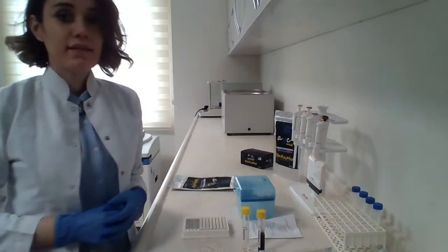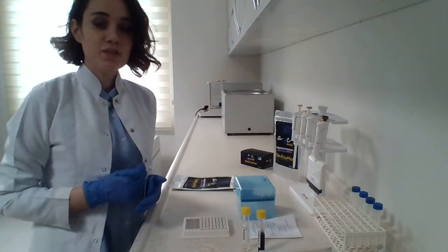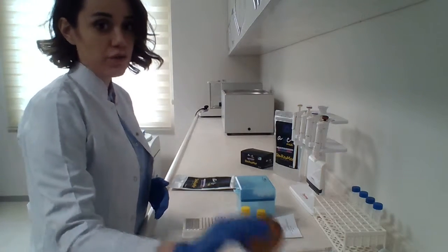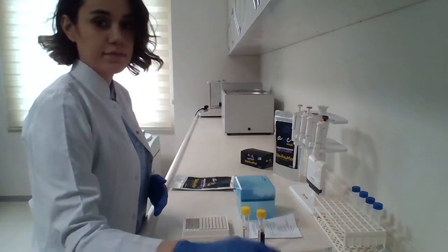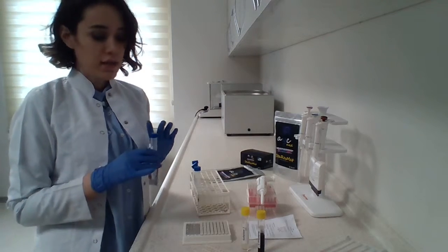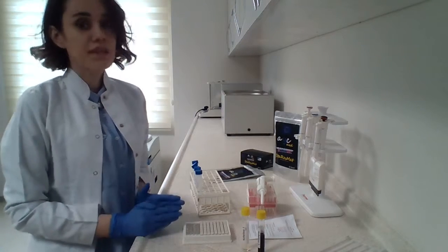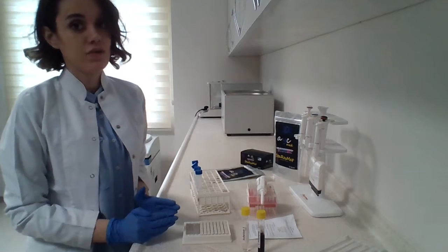In order to add the bacteria in the wells, we should set the turbidity to 1 McFarland. We are going to use pure culture of Staphylococcus aureus isolates. Now we set the turbidity to 1 McFarland, and now we are going to add 10 microliters of bacterial solution into each well, but we're going to leave the last wells because of its sterility control.